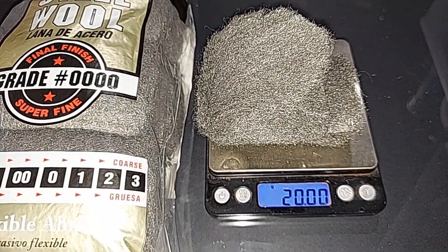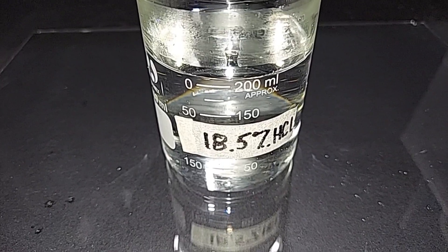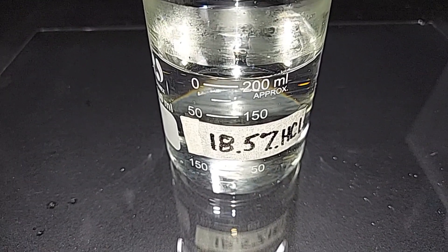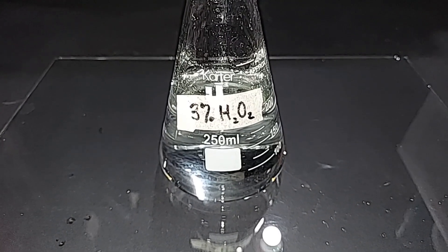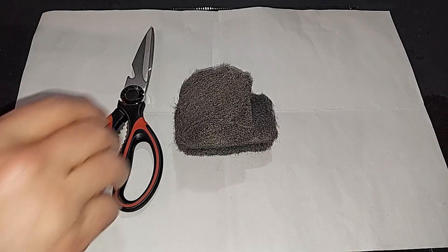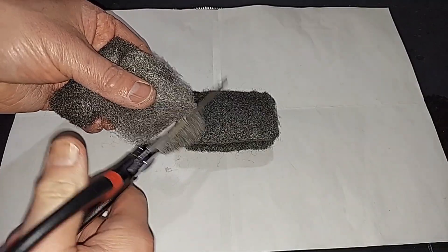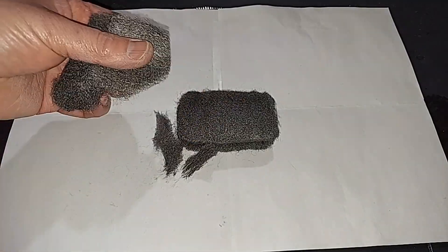Materials ready: 20 grams of very fine steel wool pre-weighed, 200 milliliters of 18.5% hydrochloric acid pre-measured, and 200 milliliters of 3% hydrogen peroxide pre-measured. I'm going to chop the steel wool into smaller pieces with scissors so it fits down into the beaker, since we're only using 200 milliliters of acid.